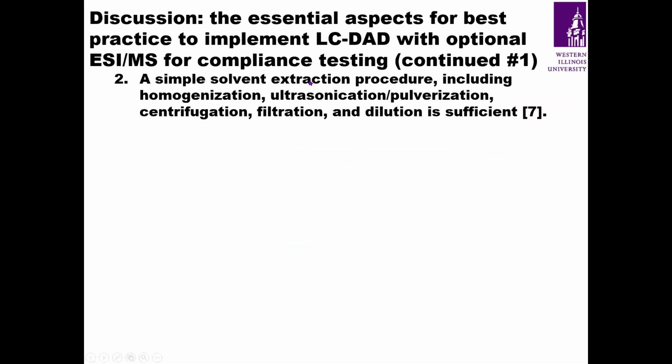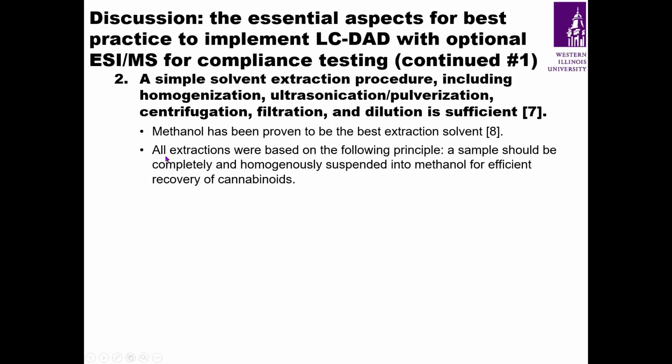A simple solvent extraction procedure, including homogenization, ultrasonication, pulverization, centrifugation, filtration, and dilution, is sufficient. Methanol has been proven to be the best extraction solvent. All extractions were based on the following principle: a sample should be completely and homogeneously suspended into methanol for efficient recovery of cannabinoids.